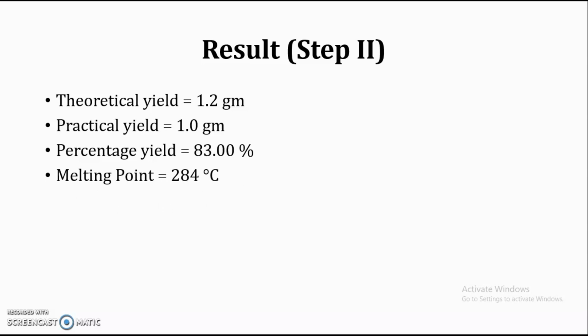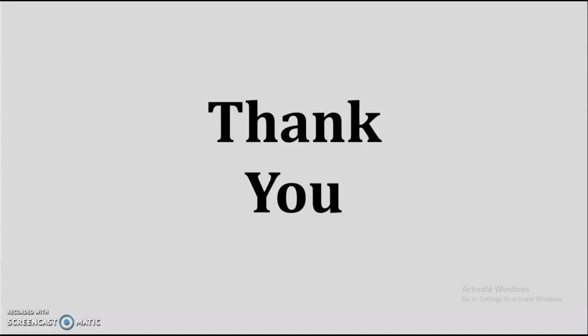So here we have seen how to perform the practical synthesis of phenytoin from Benzil in a virtual mode. So here we have completed this particular practical.